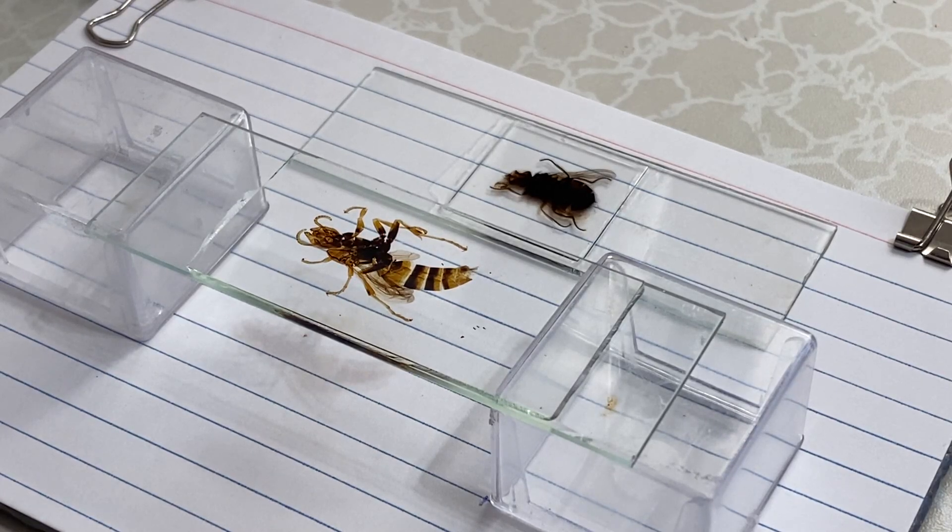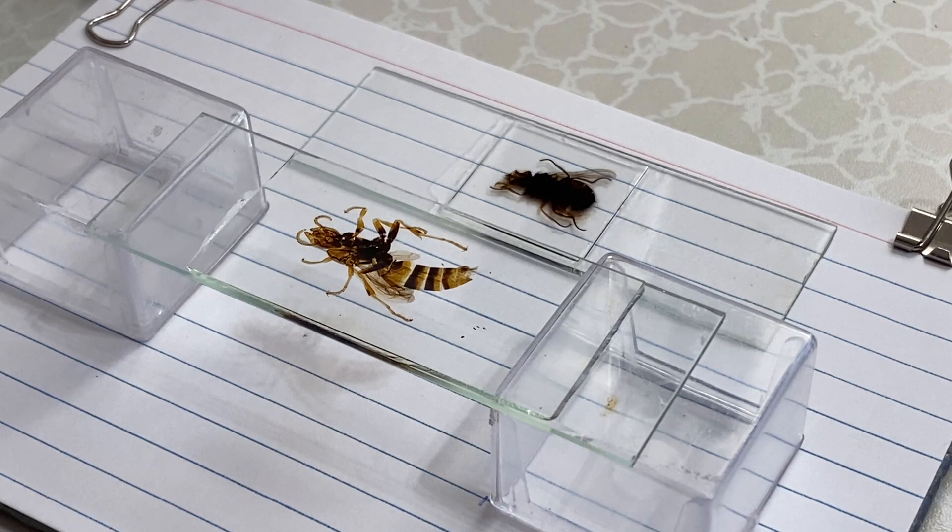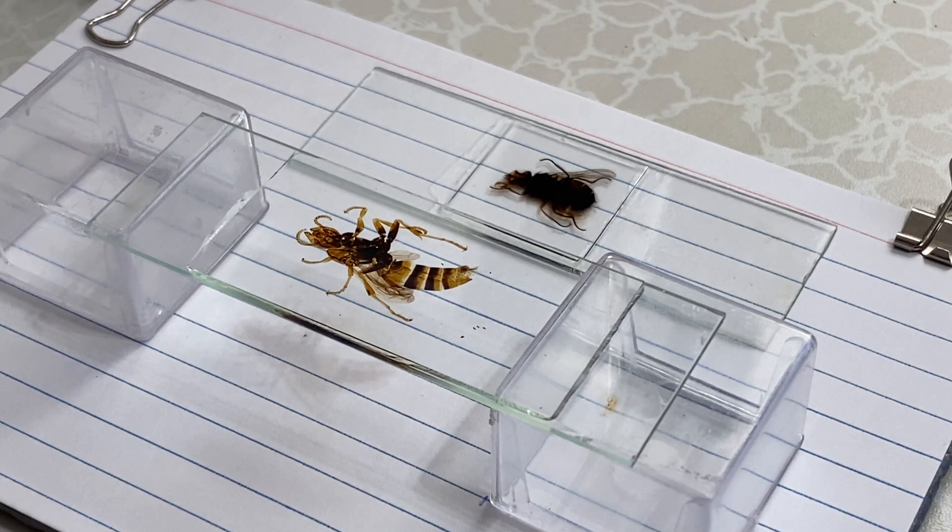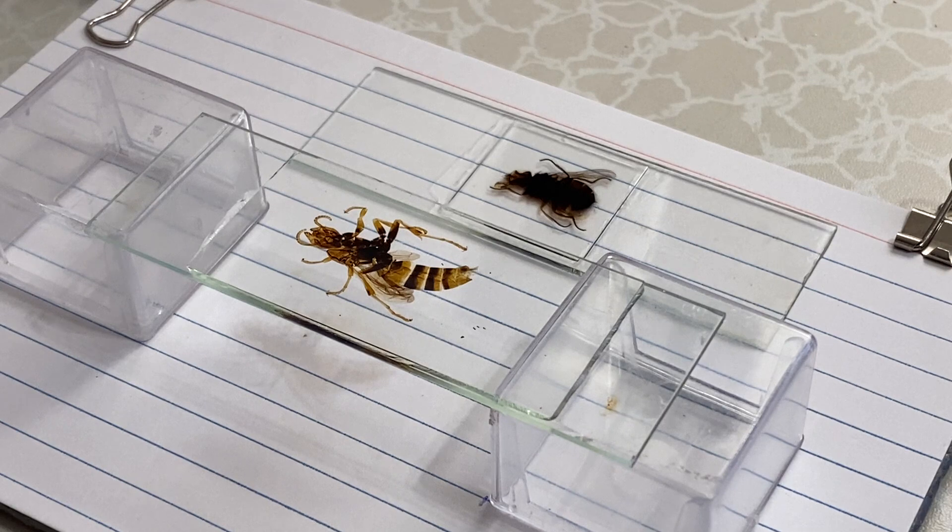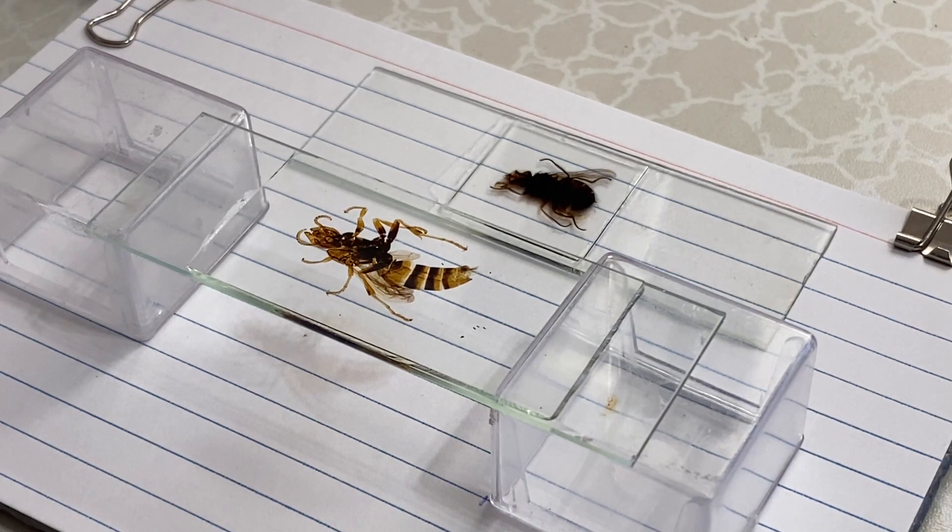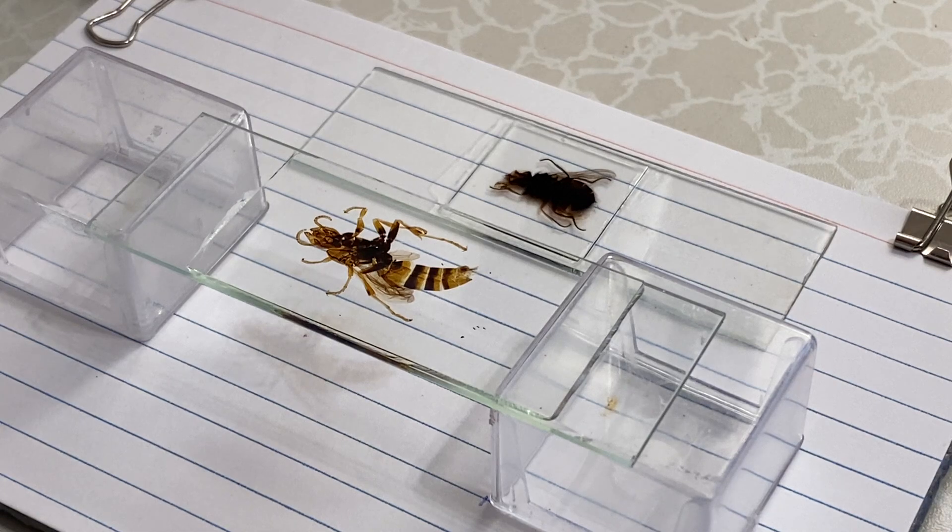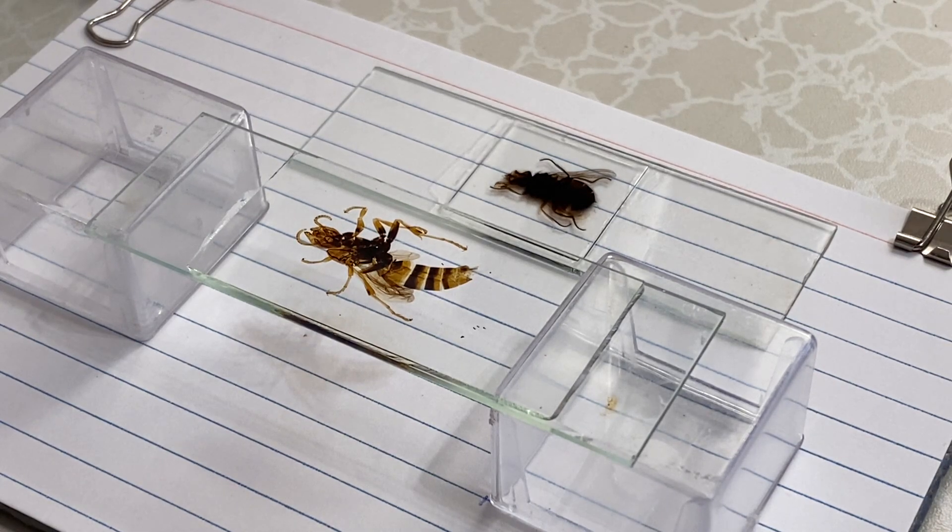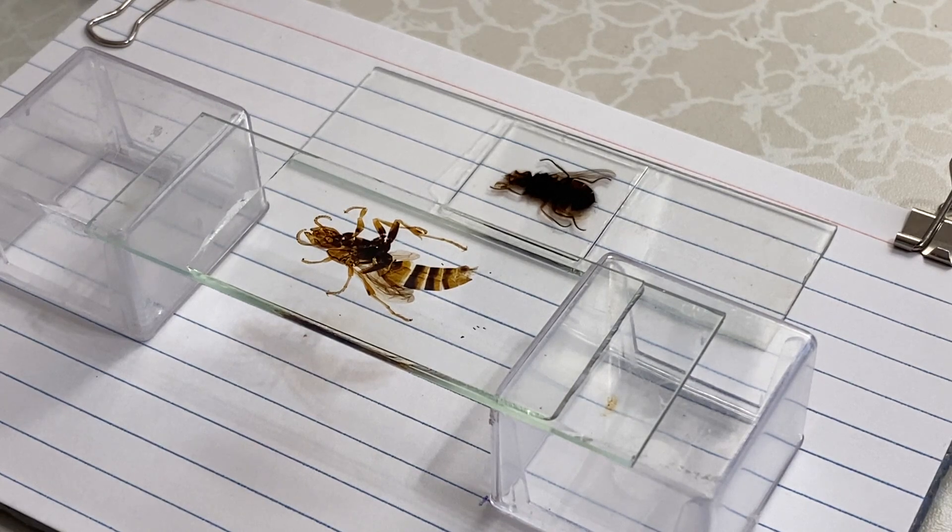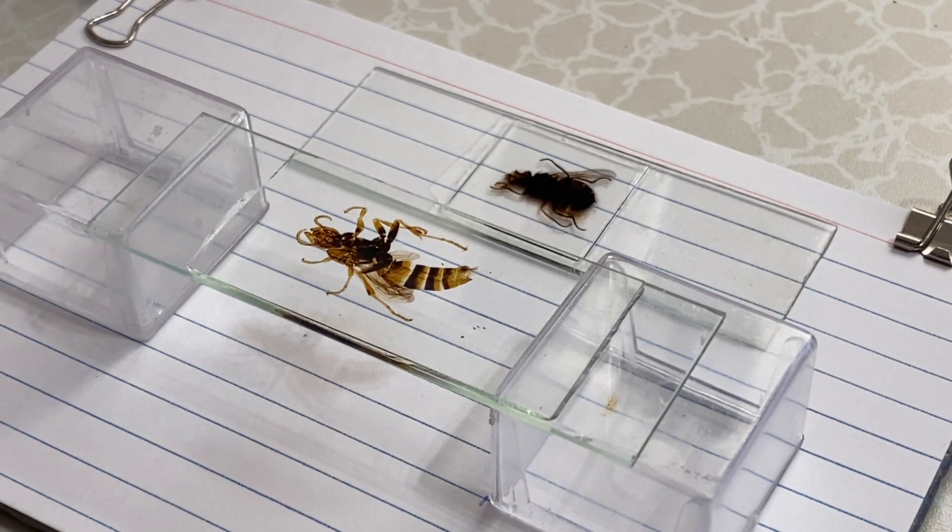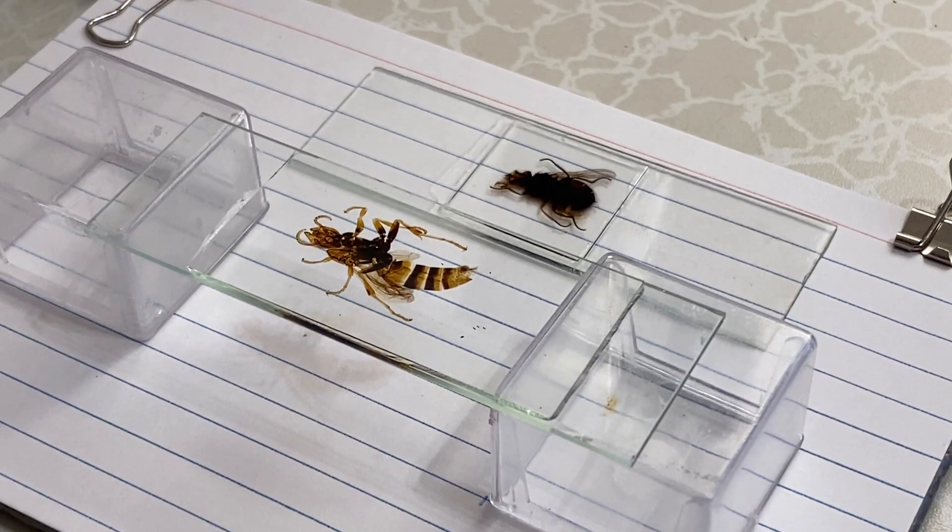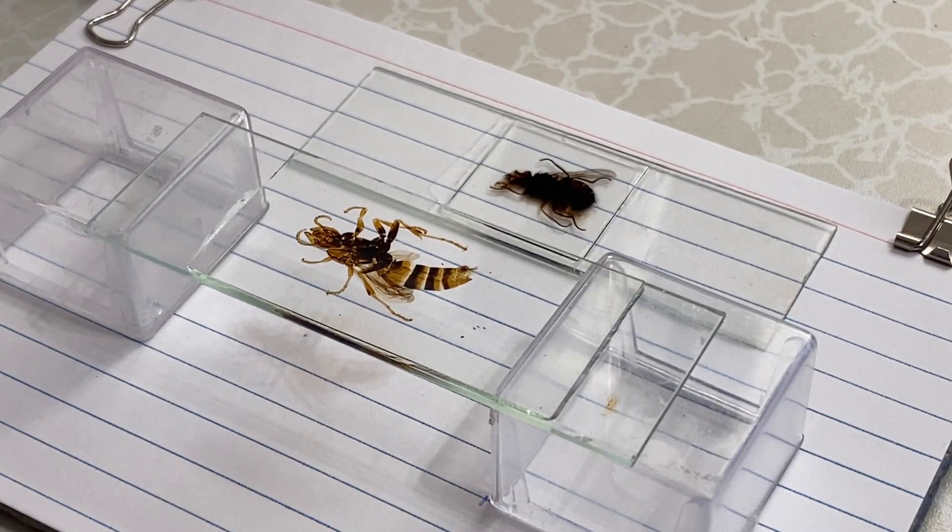A while back, the moderator of Microbe Hunter, Oliver, answered a question from one of the people on his website about making permanent slides, and I thought I would contribute this video.